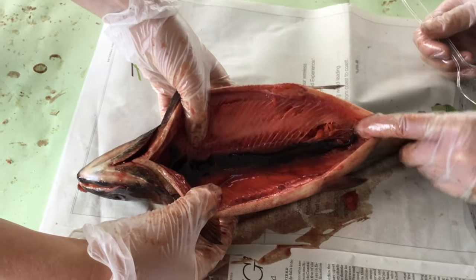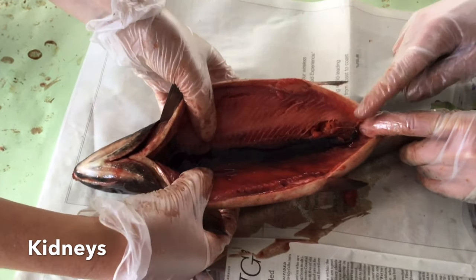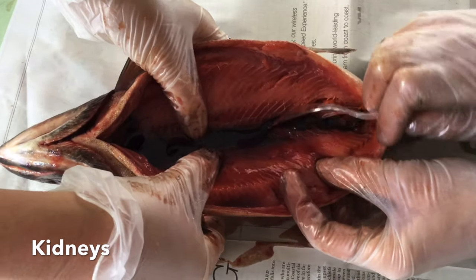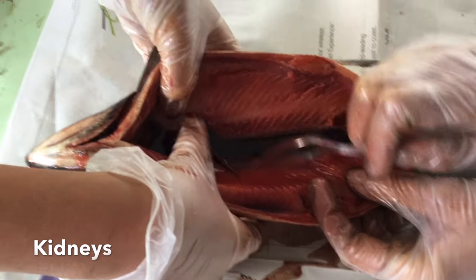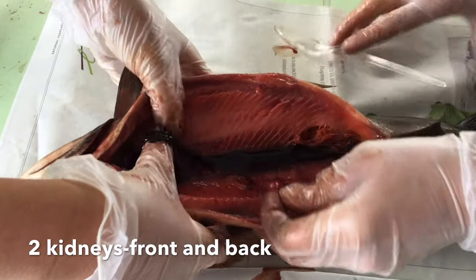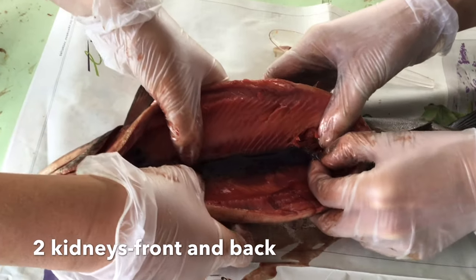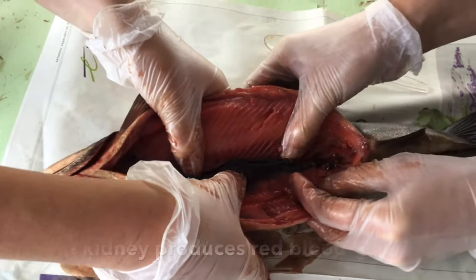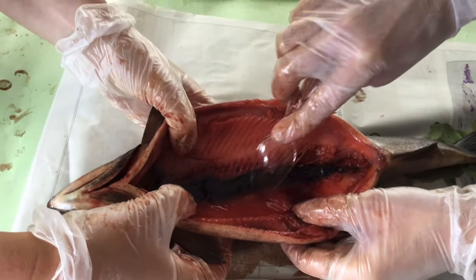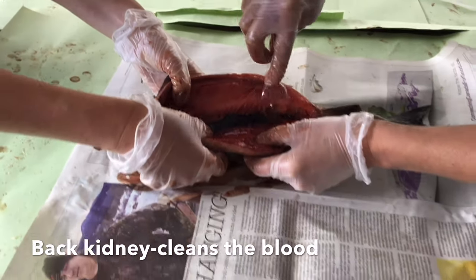Now we're going to go to the kidneys. And Misha's indicating where the kidneys are. We are going to remove the kidneys. There's actually two of them. It's a little hard to see. There's a front and a back, and each has a different function. The front kidney produces red blood cells, and the back kidney cleans the blood. So this is a tricky operation, getting out the kidneys.